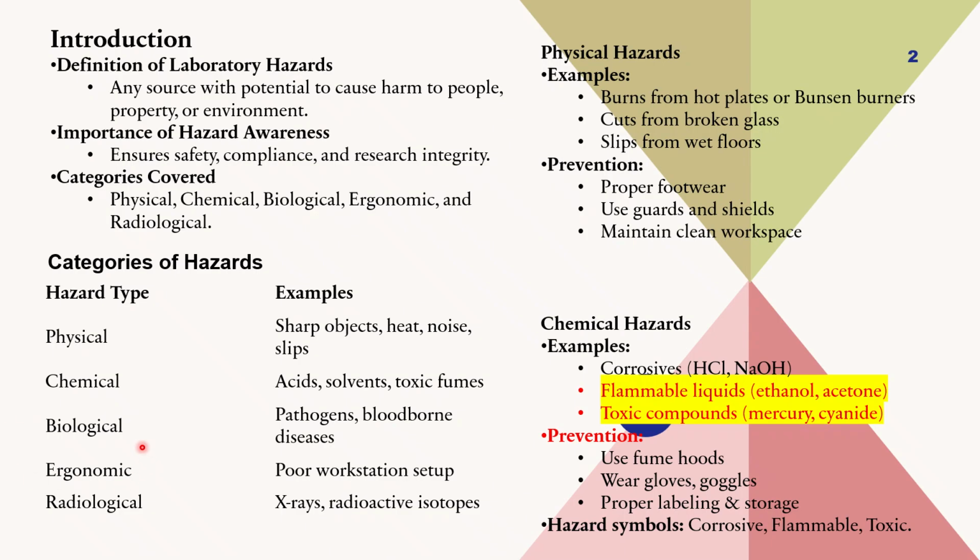Then ergonomic hazards pertain to the working style in the laboratory. Poor workstation setup will lead to various effects on the posture. Then radiological hazards include X-rays and radioactive isotopes, and hazards caused by them.